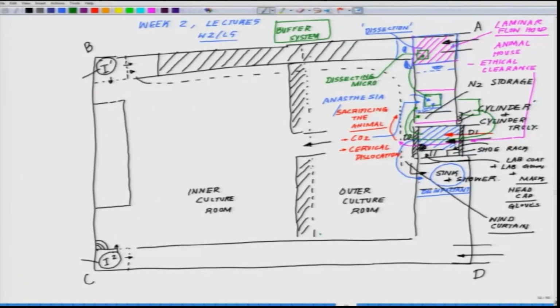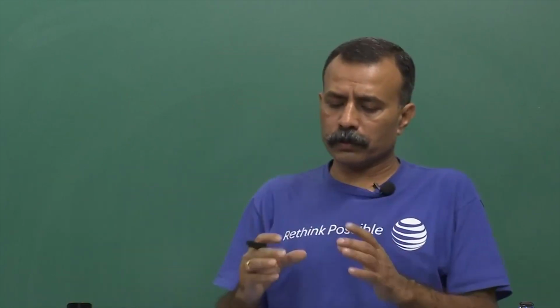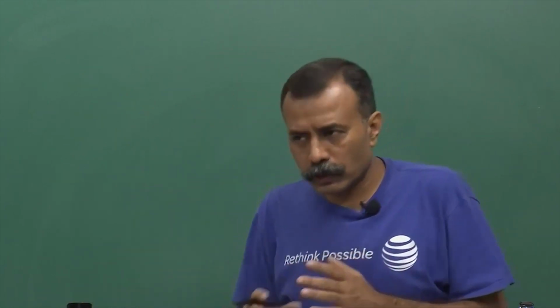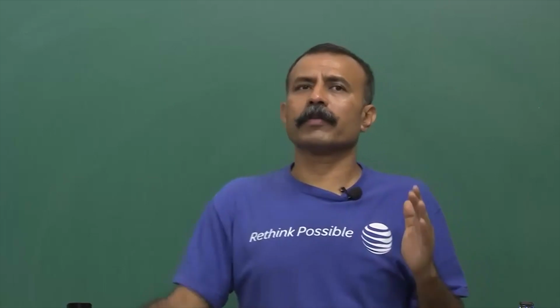You will be needing this pretty frequently. If you are dissecting big animals, you may not need it, but if you are dissecting embryos or fetus, you will be needing it. So, see through the catalogs once we come about the microscope and get a good quality dissecting microscope.